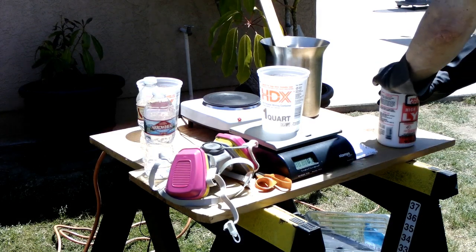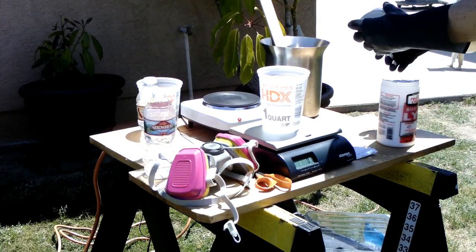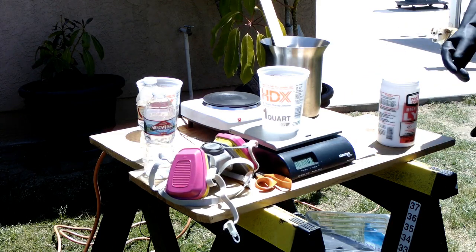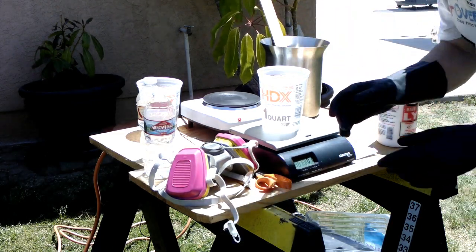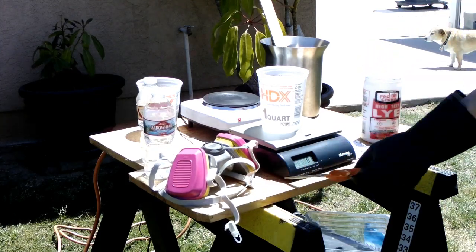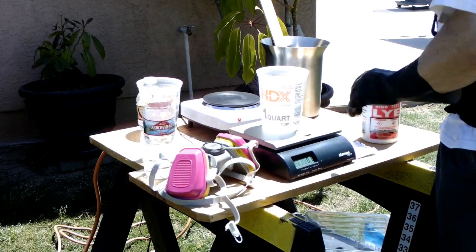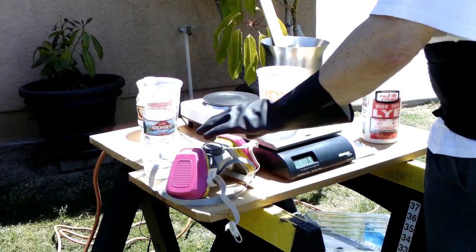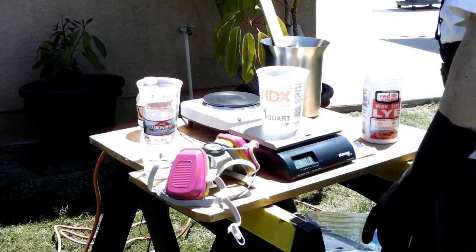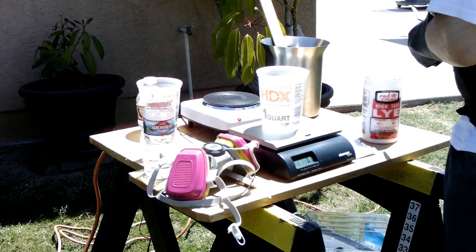You always want to make sure that you're using your PPE, or personal protective equipment. I've got goggles on and I've got gloves. This lye is pretty nasty stuff. You don't want to be breathing it, so as long as it's not very dusty I won't use the respirator just yet. But once it starts cooking and making fumes, I'll be putting on this respirator.